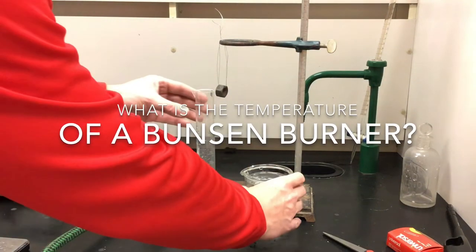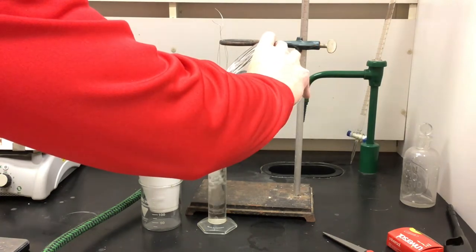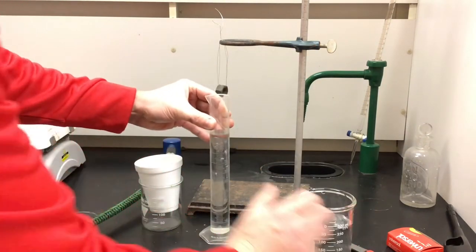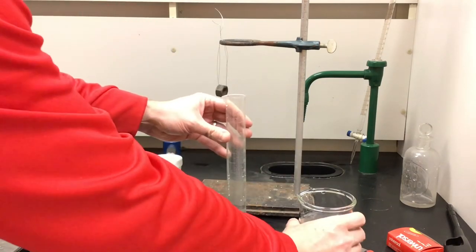Hello Palatine Chemistry. Today we're going to try to find the temperature of a Bunsen burner flame. We're going to start by getting 200 milliliters of water using a graduated cylinder. We have our styrofoam cup nested in a beaker for stability.